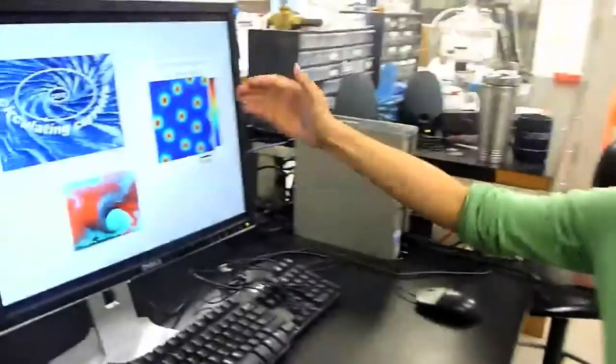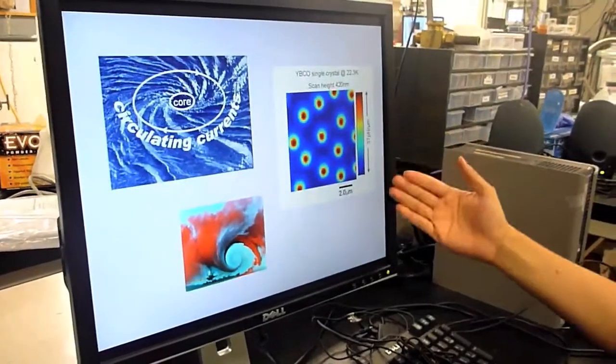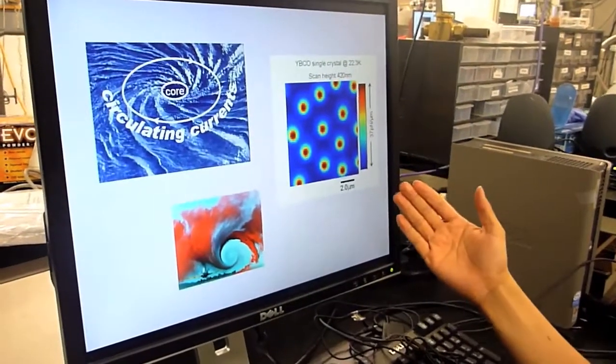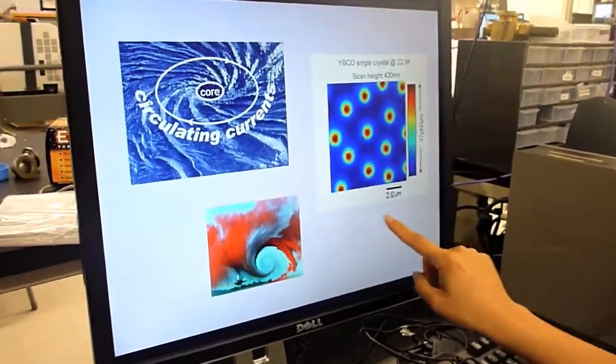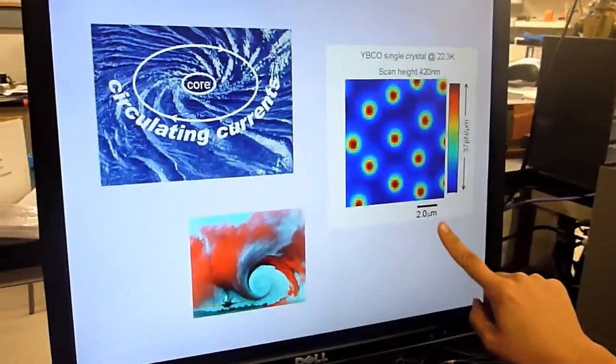Now I'm going to show you one example we study with this magnetic force microscopy. Here is what we call images of superconducting vortices on a very small scale. So you'll notice the scale here is 2 microns.